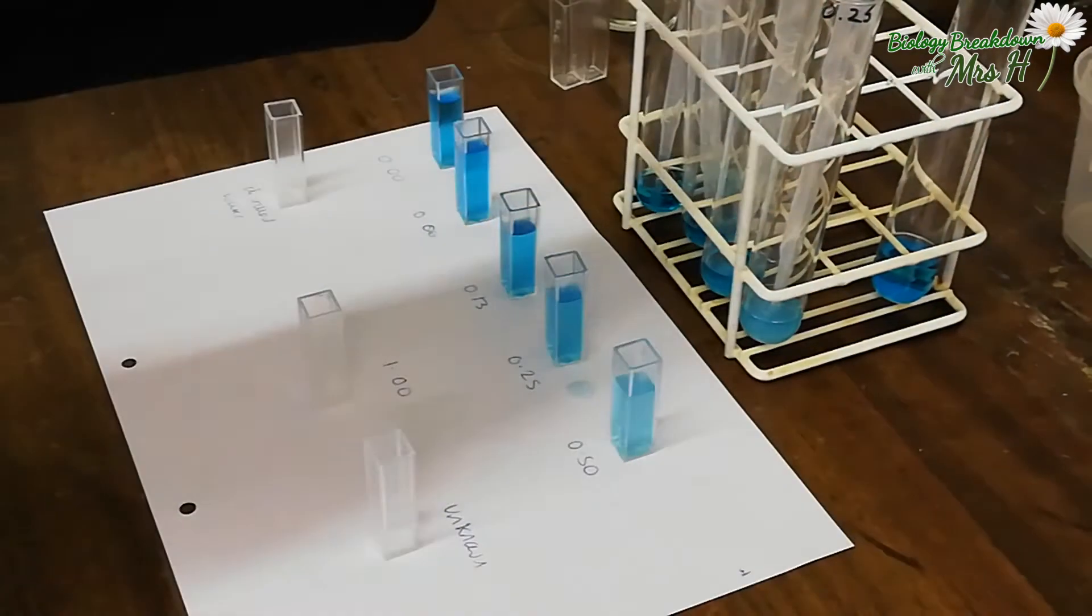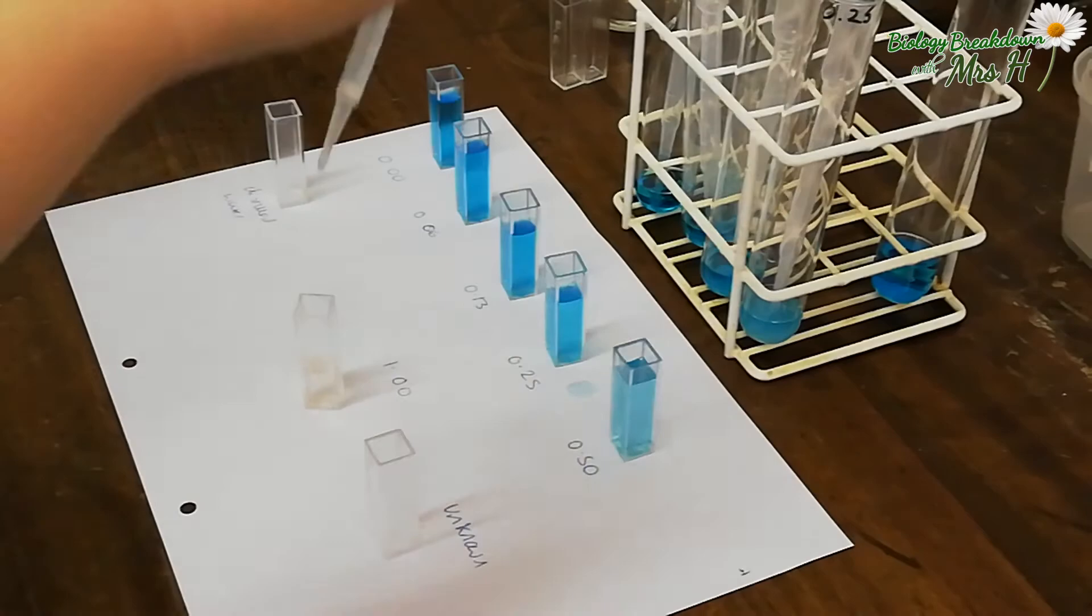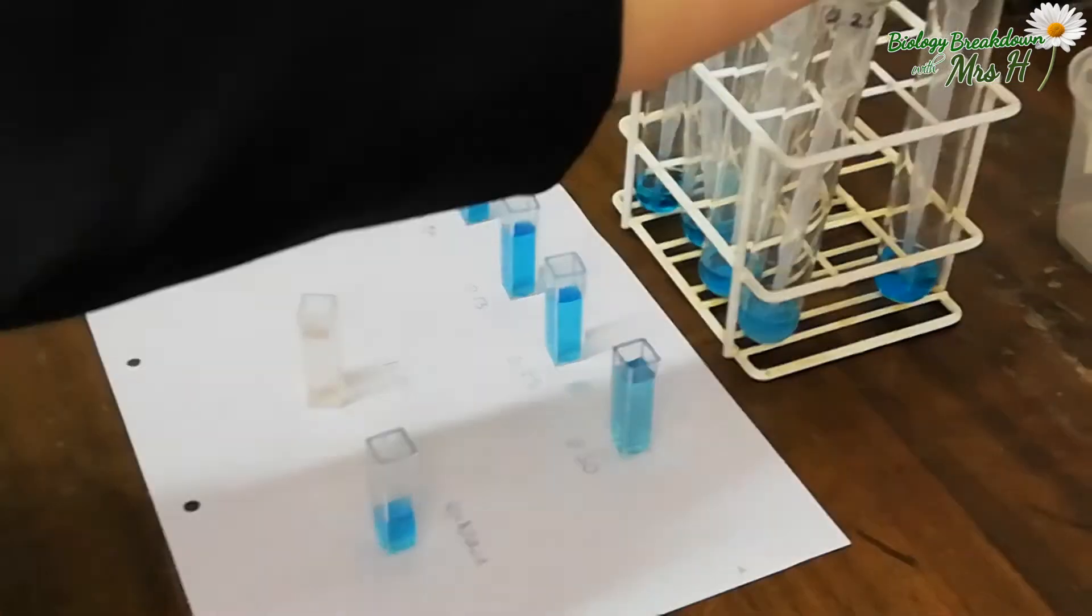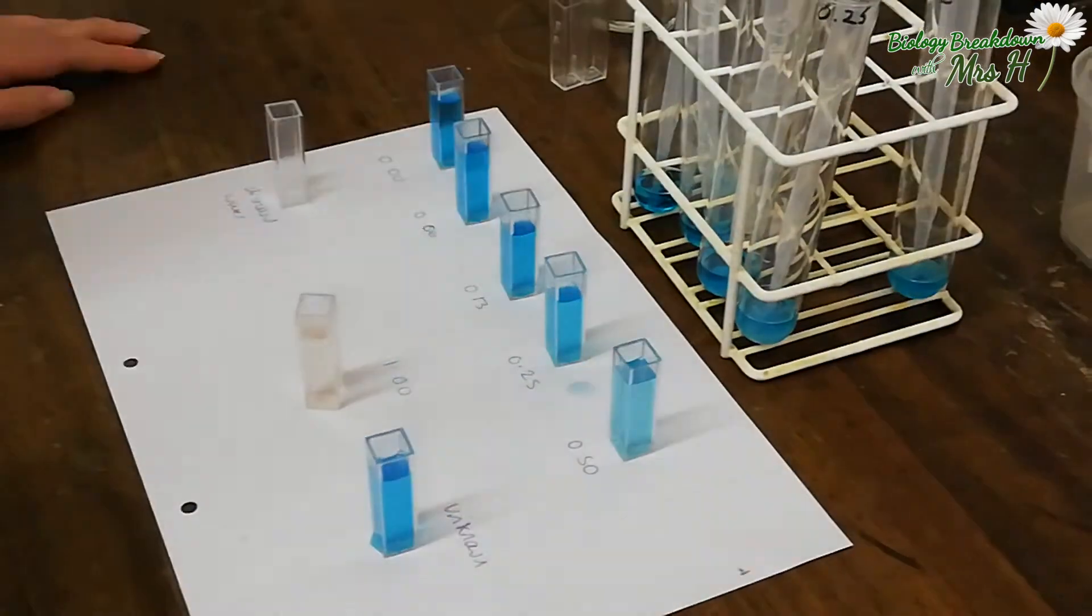And finally, you'll put distilled water into the last cuvette. This is so you can use this one as a reference to calibrate the colorimeter.